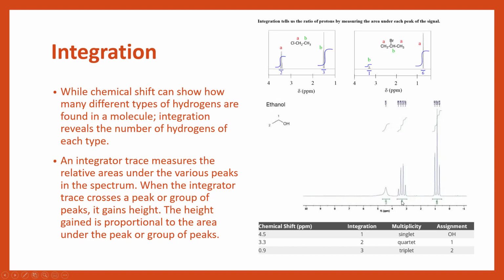In our instrument then, we would just integrate it, okay? And we'll go through this in the online lab next week, how we actually go about integrating this, because the instrument will do an automatic integration, but it's not always true. So we typically need to normalize our integration ourselves just to a peak that we know for certain is either representing 1 hydrogen or 2 hydrogens, one that we're very, very confident of, and then everything else will be integrated in relation to that.